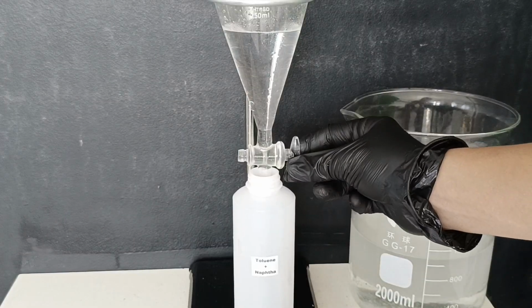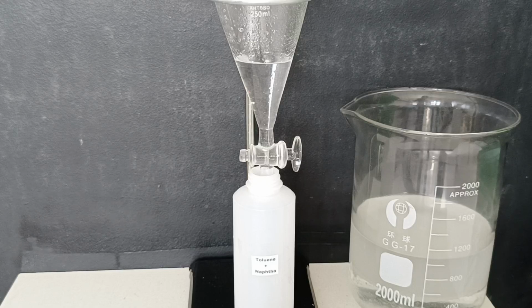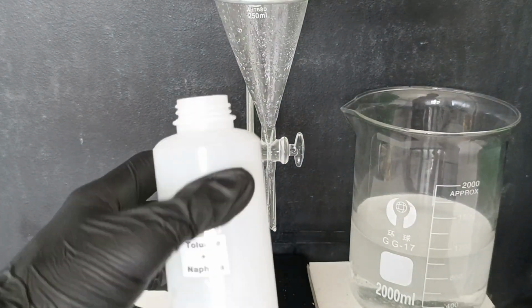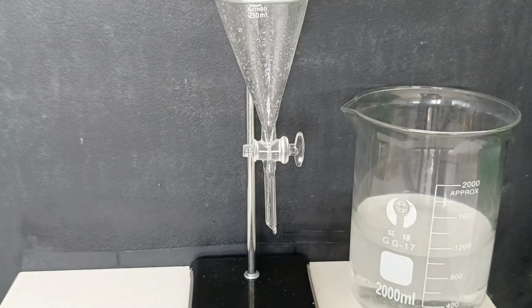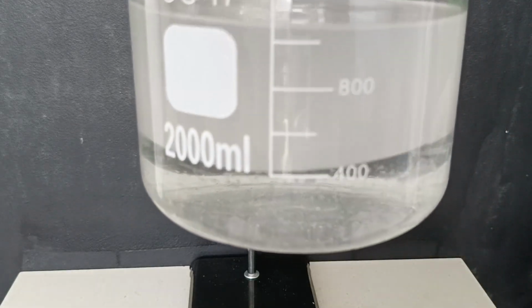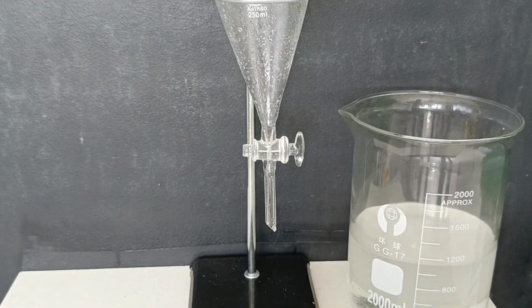Now that my organic layer is dry, I drained it into a labeled bottle. We still have a bunch of dirty wet toluene in our large beaker, so the same process was repeated several times until all our toluene was cleaned.